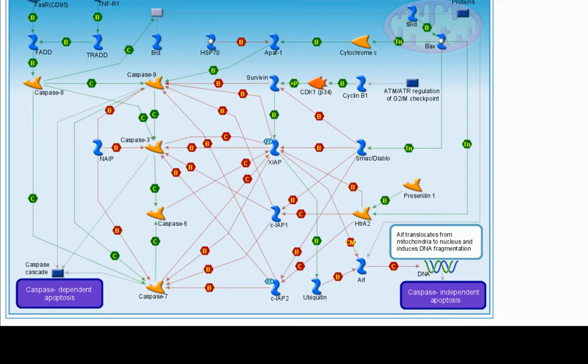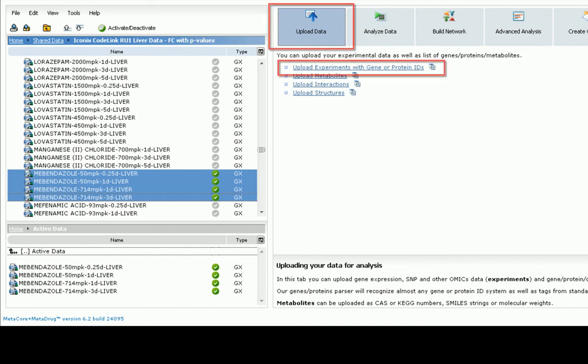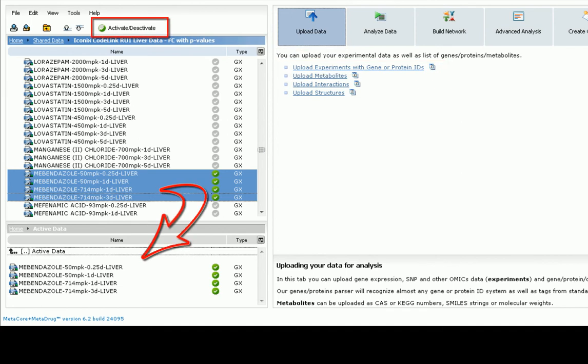To further confirm this hypothesis, different types of omics data, such as expression data, can be uploaded into MetaDrug and used for additional validation with this map. For this study, we uploaded four expression profiles obtained after treating rats with Mebendazole using our experiment parser. Let's activate the profiles by selecting the data and choosing the Activate button and refresh the map to visualize the data.